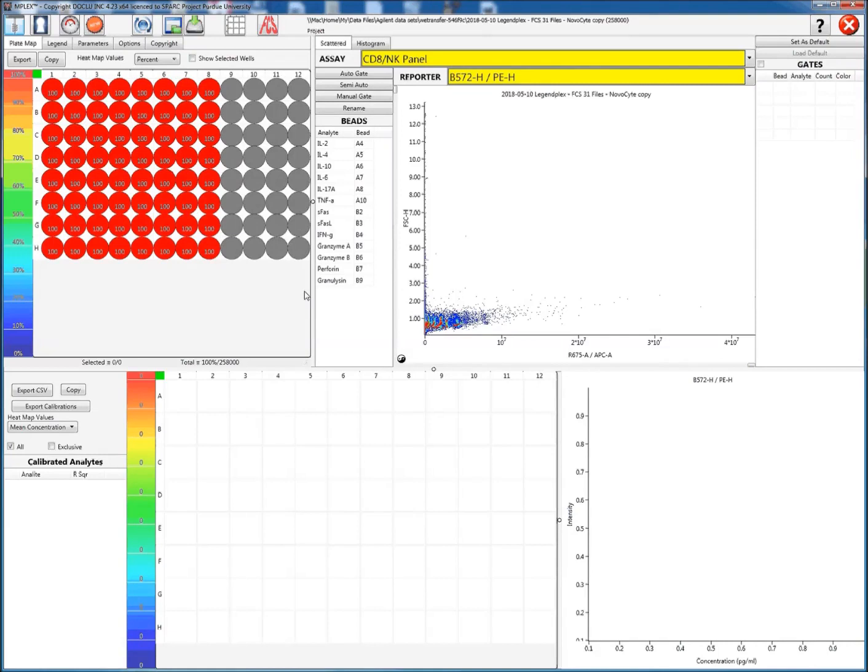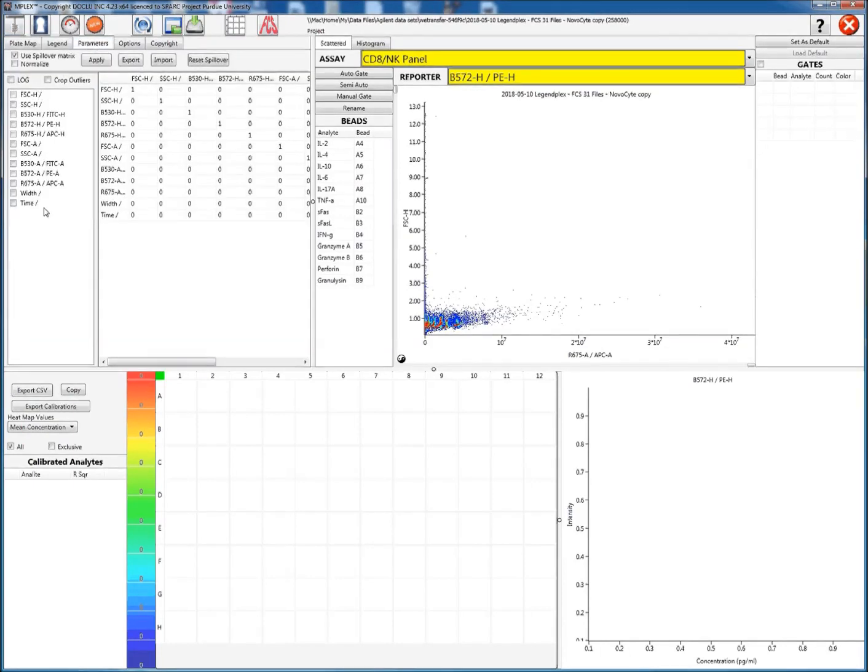Now the data are mixed up in the bottom here. I have selected the correct parameter here and here, but they look a bit messy. So why are they looking like that? Well, it's very simple. They're actually log data and they're not being plotted out as log.